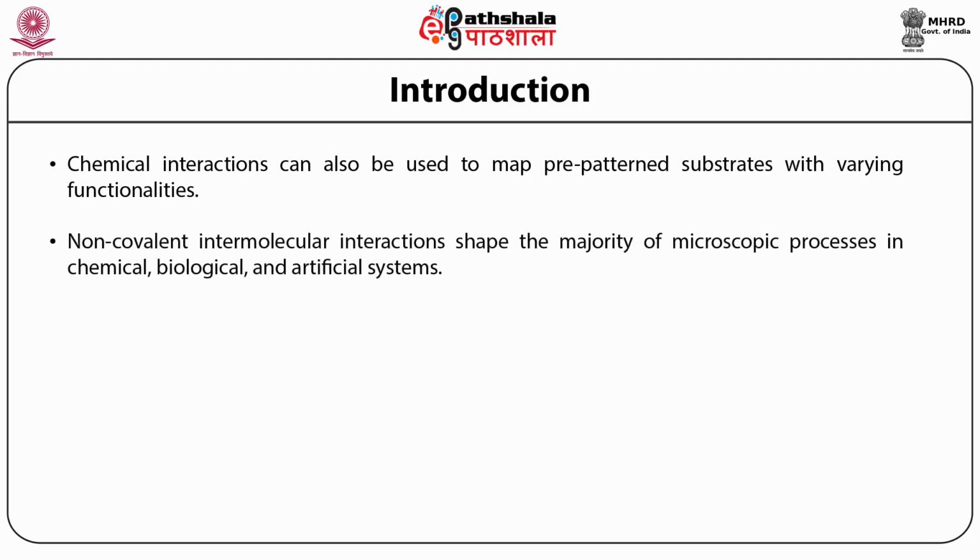Non-covalent intermolecular interactions shape the majority of microscopic processes in chemical, biological, and artificial systems. Examples range from lock and key interactions that define molecular recognition to interfacial adhesion and friction that define performance and wear of industrial equipment.